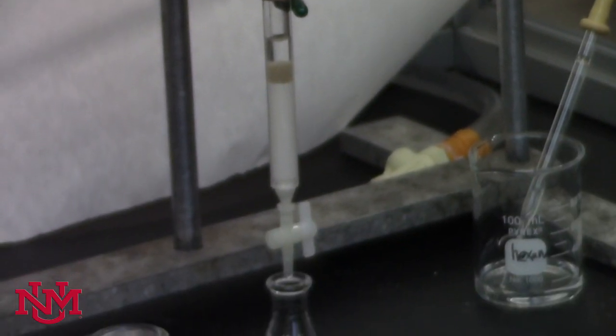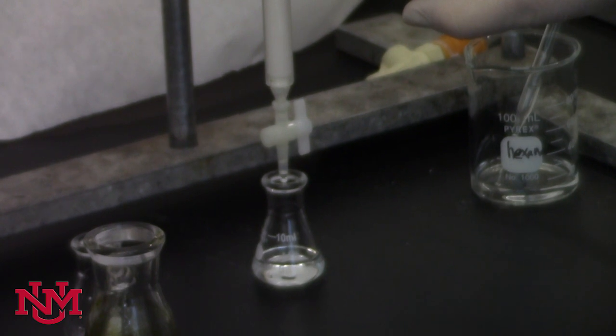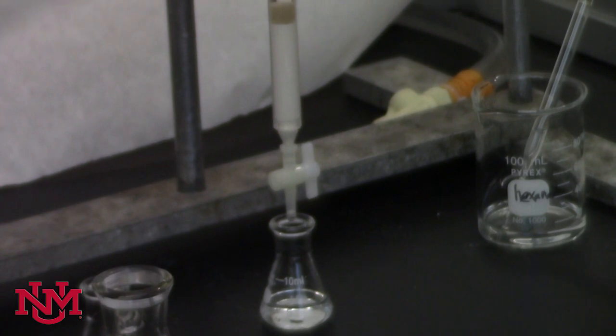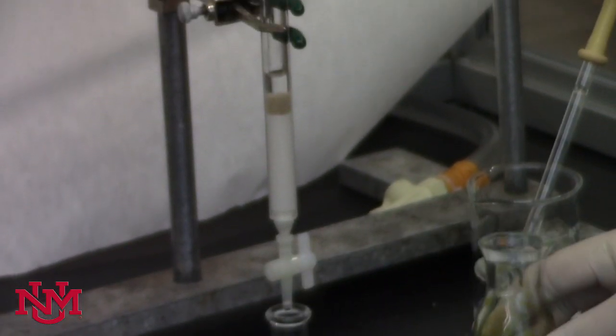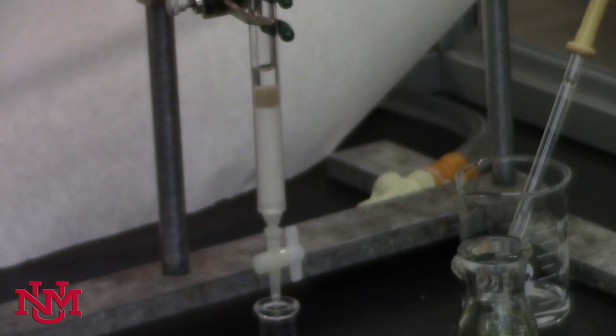At this point, we want to drain the hexane all the way to the level of the top of the sand. When we get to that point, that's when we can apply our sample or our green spinach extract onto the column and begin to separate the pigments.